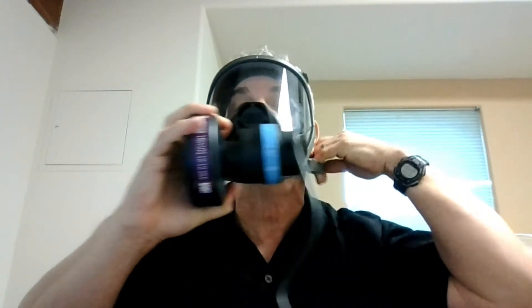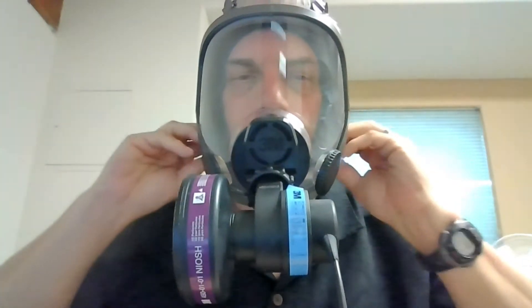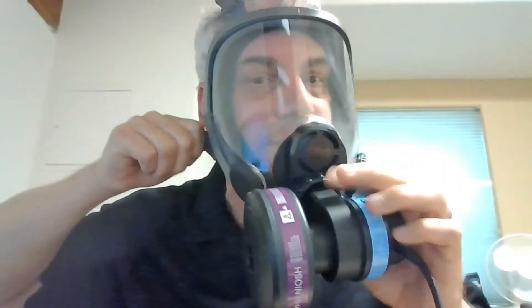You want it loose enough that you can pull it over your face, but tight enough that it holds itself in place while you tighten the straps. Tighten the upper straps first, then go and tighten the lower straps to make it snug to your face. You can tell it's snug because the face shield will start fogging up.